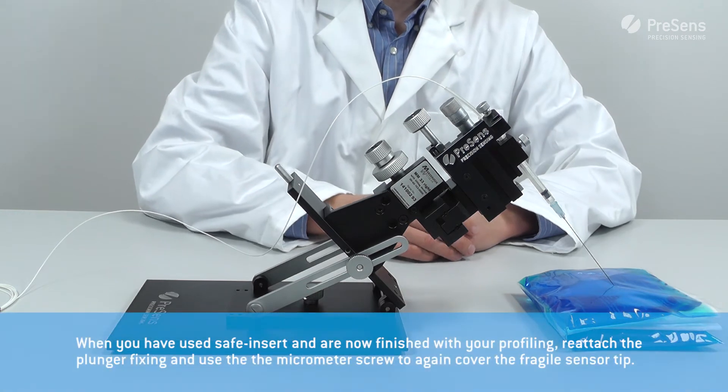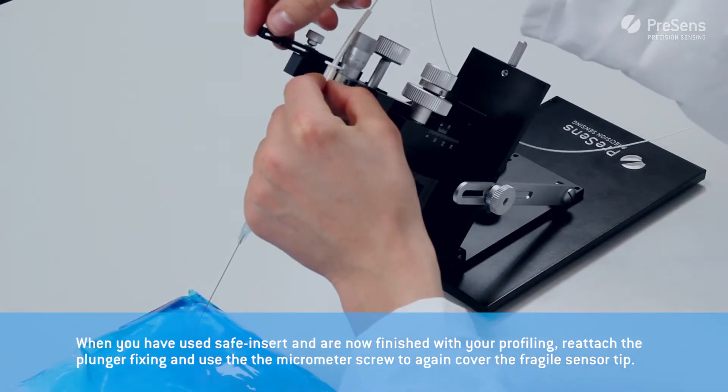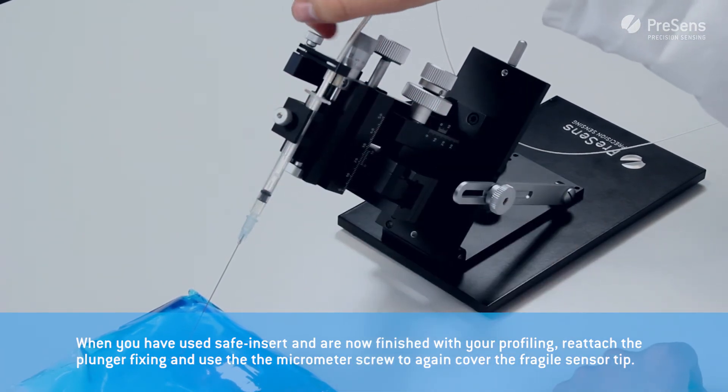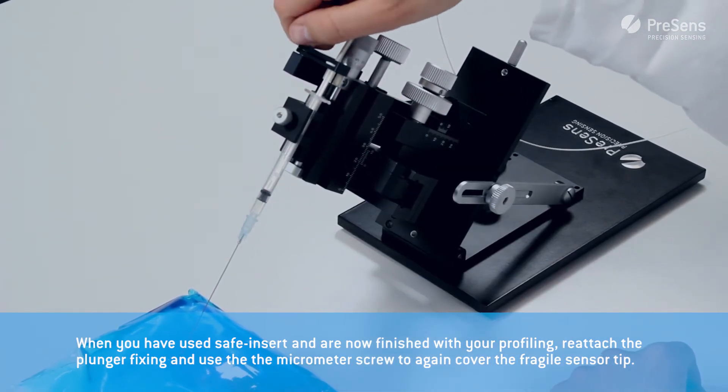Wait between sensor movements until the measurement is taken. When finished with your measurements, reattach the plunger fixing and use the micrometer screw to cover the fragile sensor tip again.